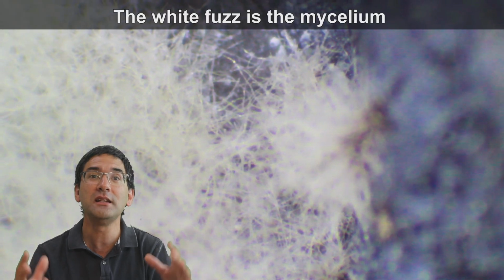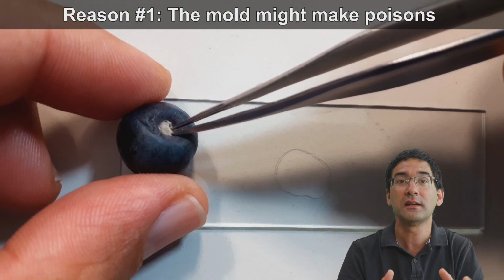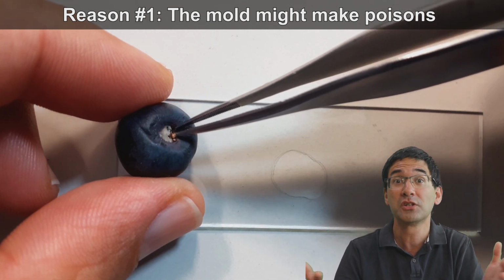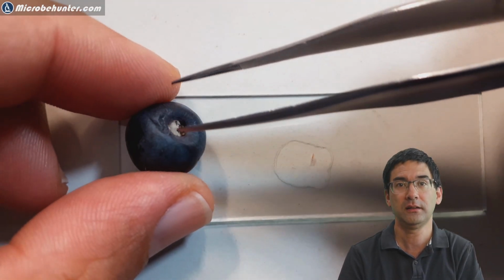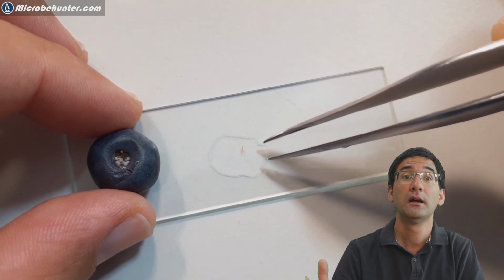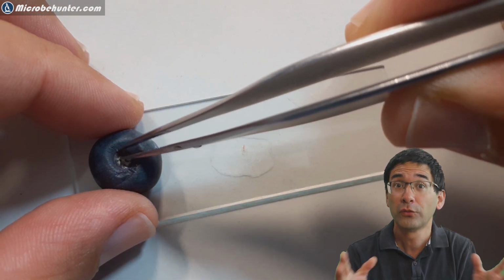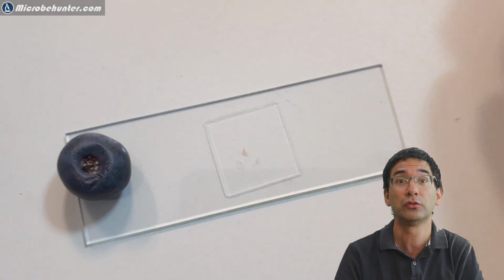And if you see here those little fuzzy hairs, well, these are of course not hairs, that's the mycelium, that is the actual mold. And what happens is that this mold grows into the food and the cells basically grow into the food and there they cause the food to become spoiled. And the mold also can release certain toxins, poisons, that really make you ill when you eat the food. So often cutting away the moldy part is simply not enough, because of course the mycelia has grown already into the food and chemicals have already been released.